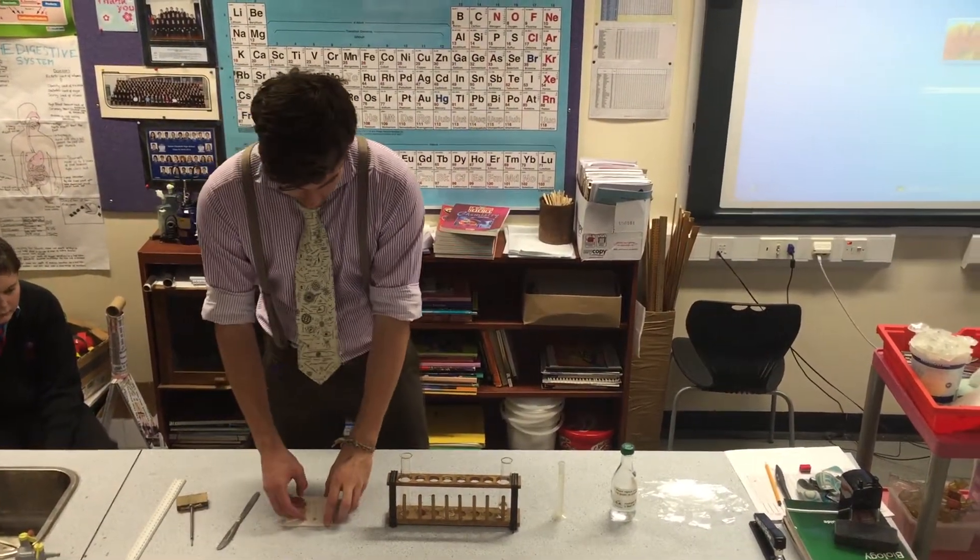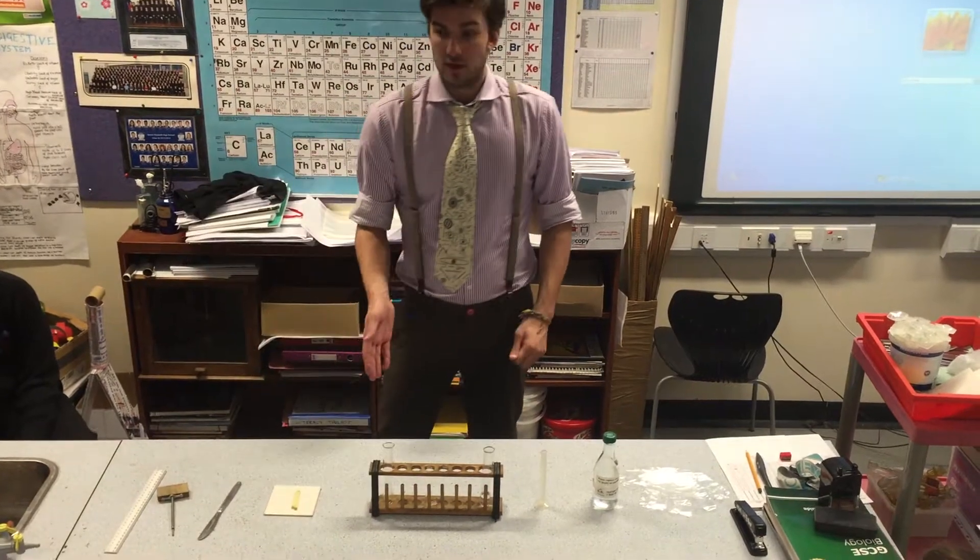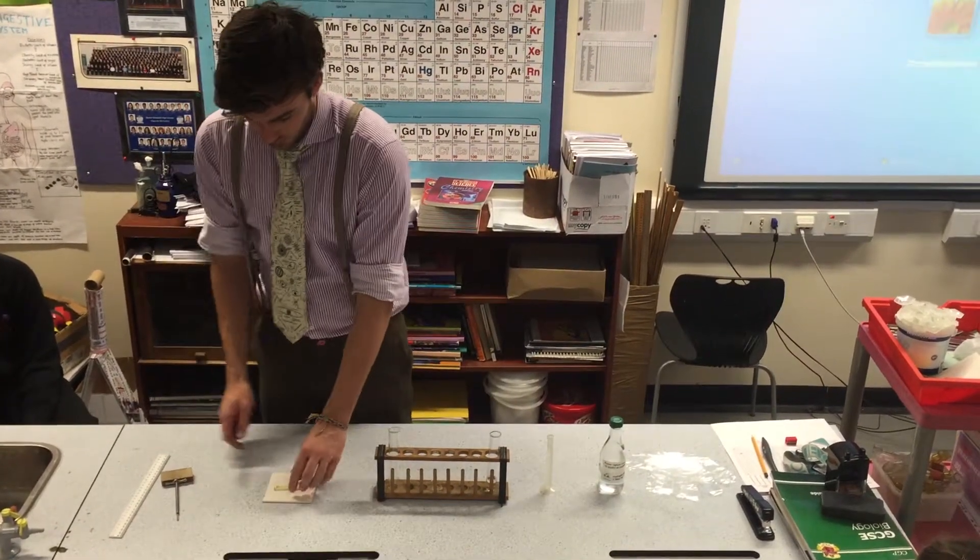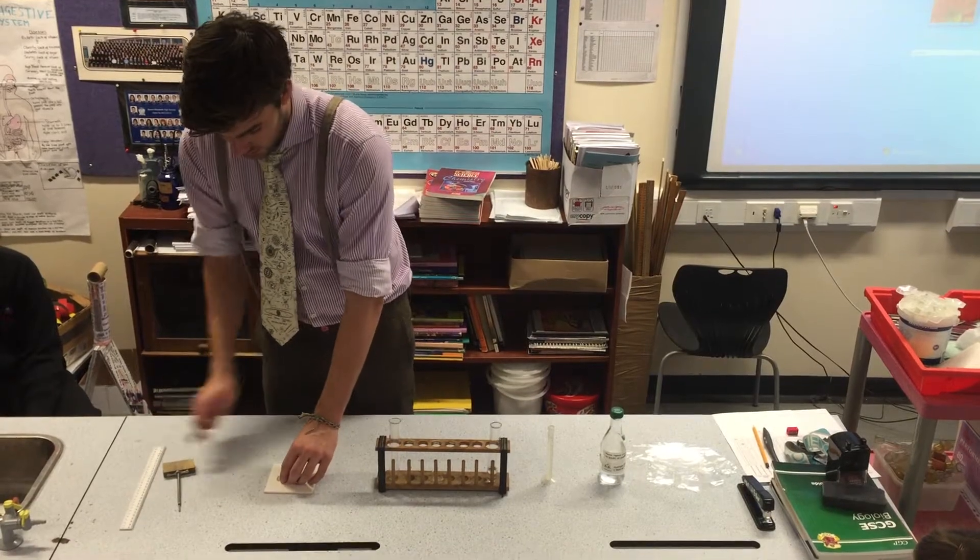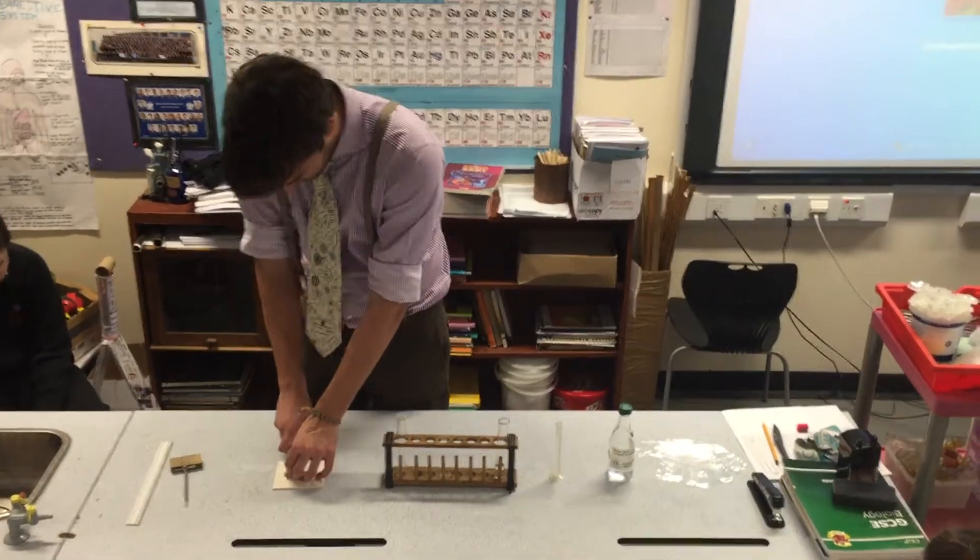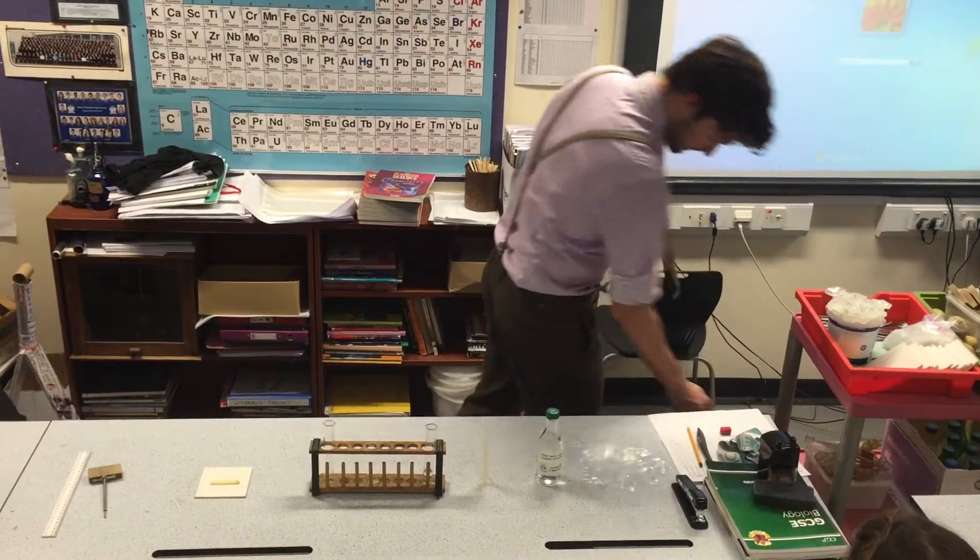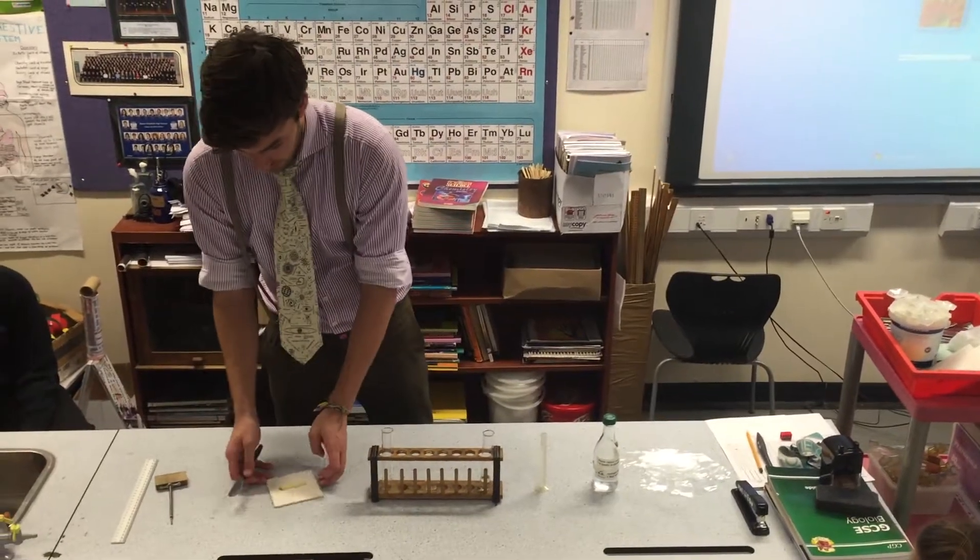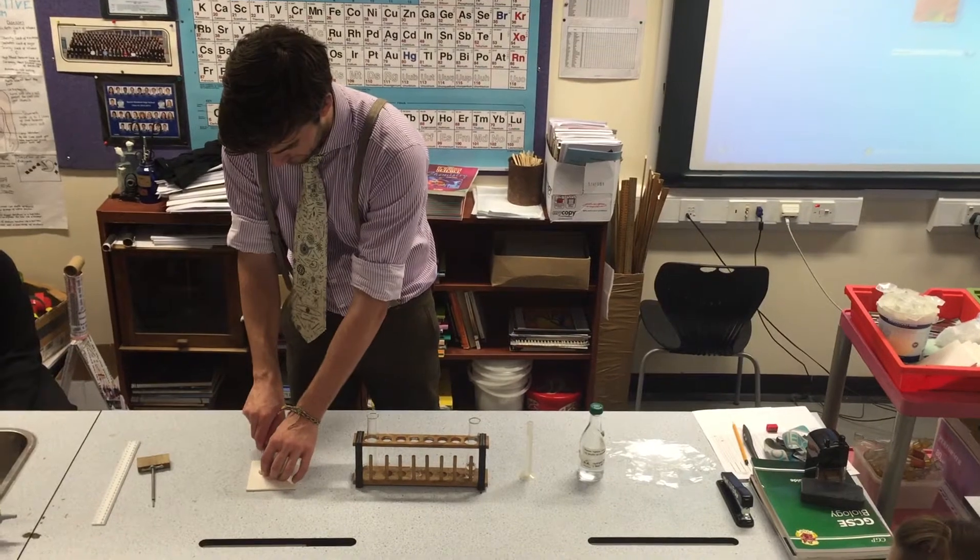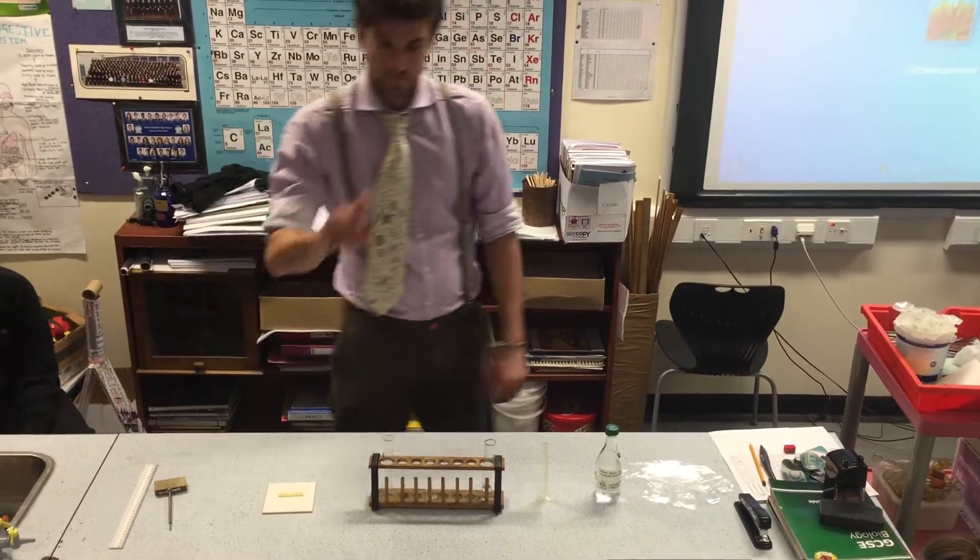Although these are similar lengths, they are not identical. So to start off with, what we're going to do is just chop the edges off. You're going to put those in the bin. And chop the other edges off like so, and put those in the bin.